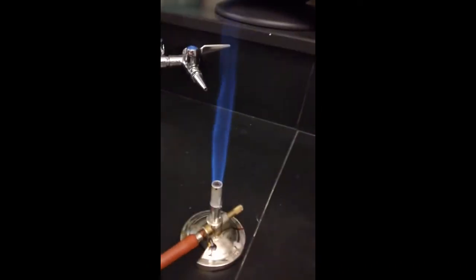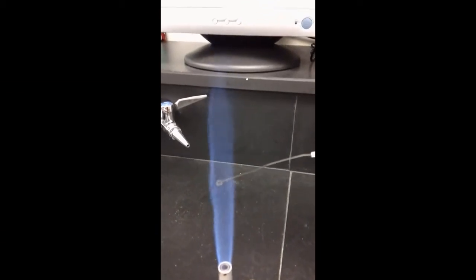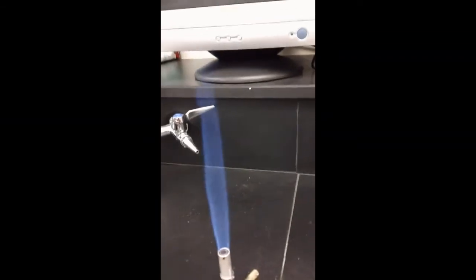Okay, so the next chemical I'm gonna do is ZN. Right here, this is my zinc. And so I put it in there, make sure I have a full bubble. Come over here. Gotta get that full bubble. Again, super quick. I'm gonna do it one more time so you can see it.